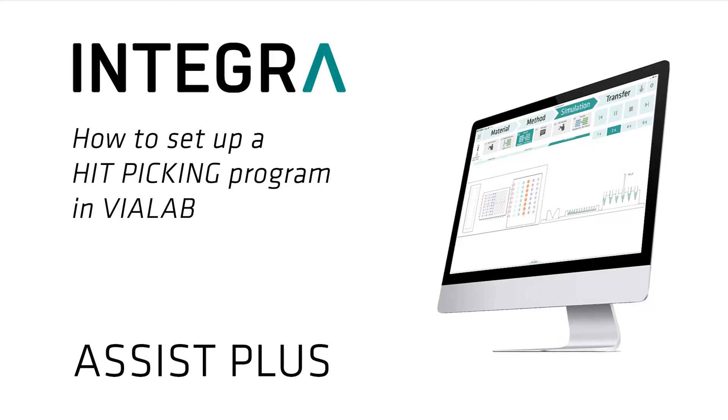In the following video we want to show you how easy it is to set up a hit picking program in VIALAB for the Assist Plus Pipetting Robot.